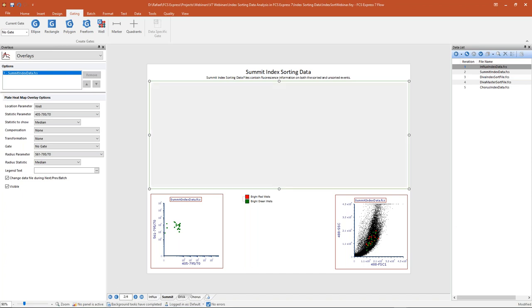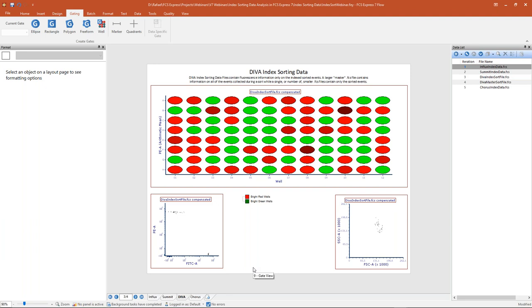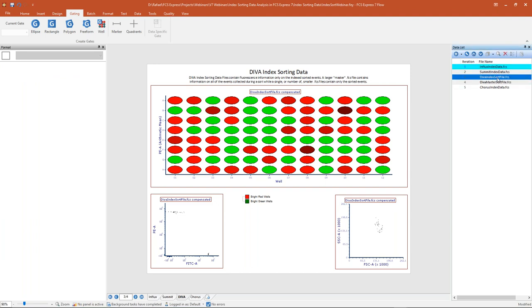Moving on to the next page, we're going to look at data files from the DIVA software. With DIVA, the way our data works is a little different. The main difference is that DIVA collects two sets of separate files: a larger master FCS file containing information on all events collected during a sort, and then either a single index sort file or a number of smaller files containing only the index sorted events. You can see in my data list the master sort file that contains all events, and my index sort file containing the cells I've actually sorted onto my plate.